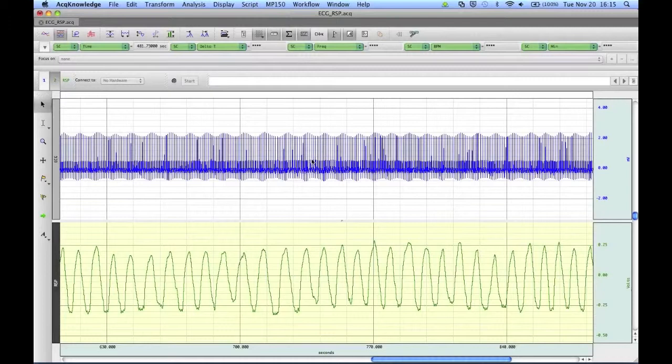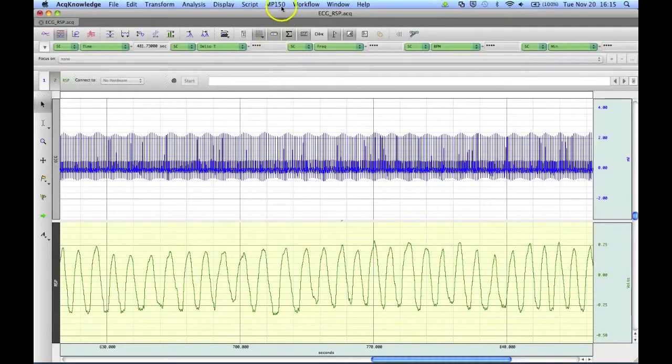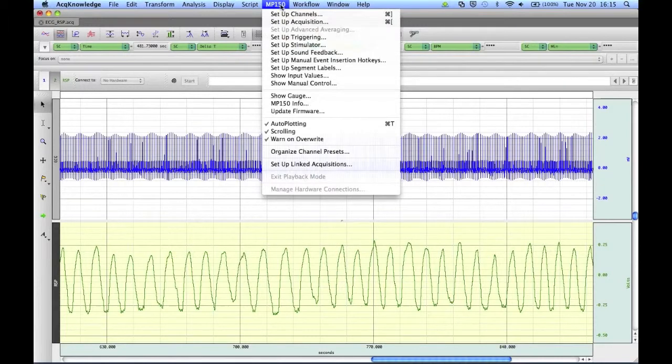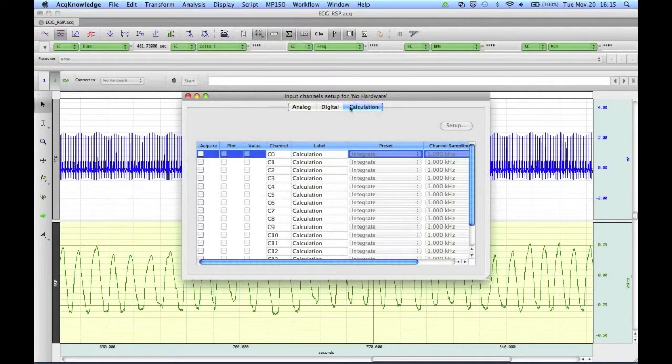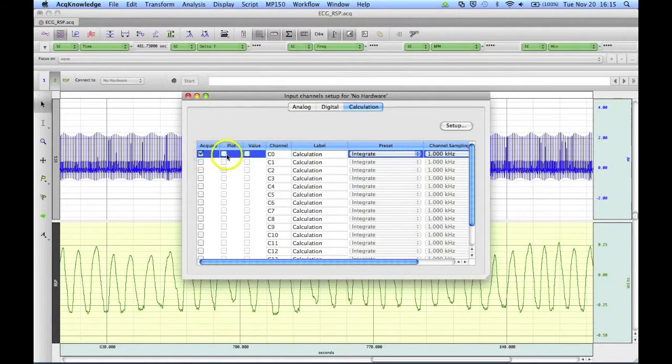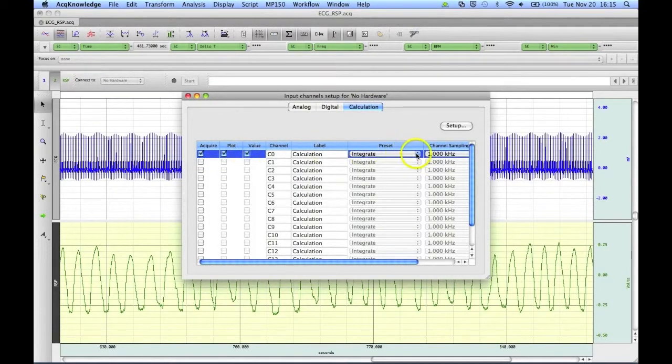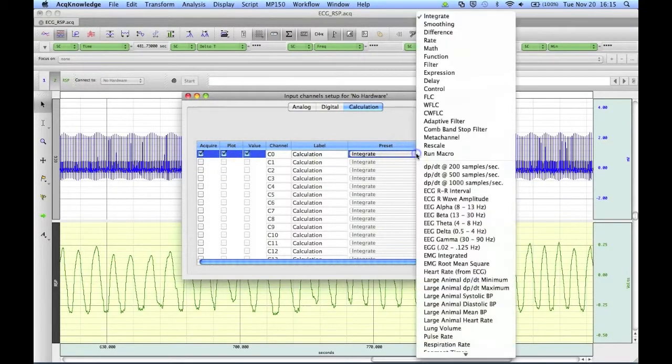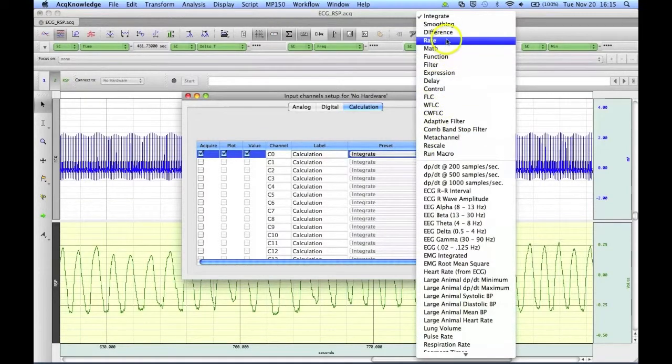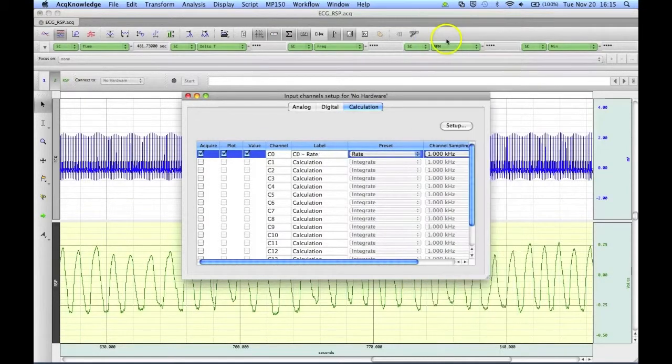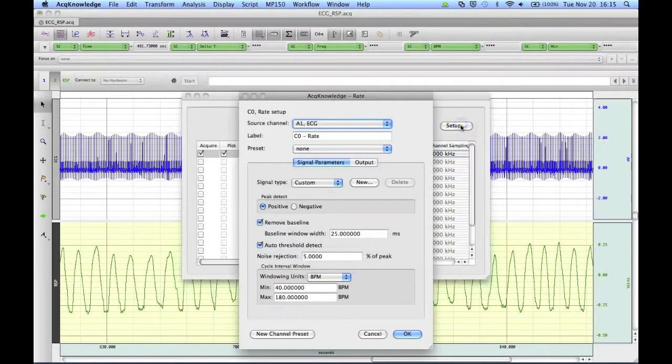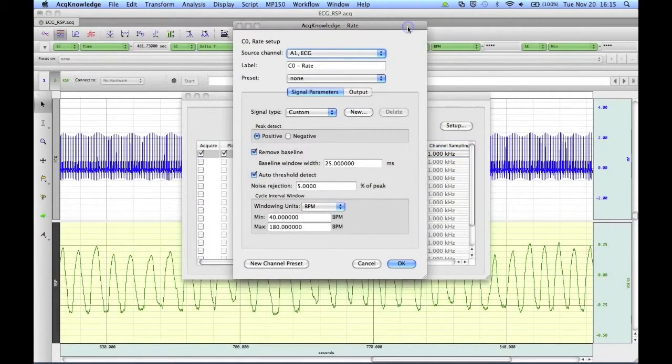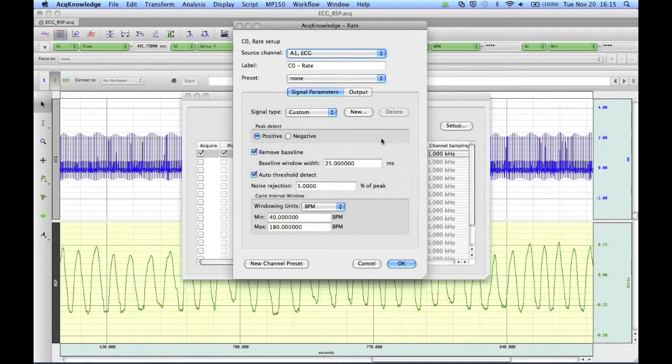To create a new rate preset as a calculation channel, we can go up to the MP150 menu, select Setup Channels, go to the Calculation tab, turn on a calculation channel, then choose Rate from the preset, then click the Setup button, and will be presented with a dialog box that contains our signal parameters.